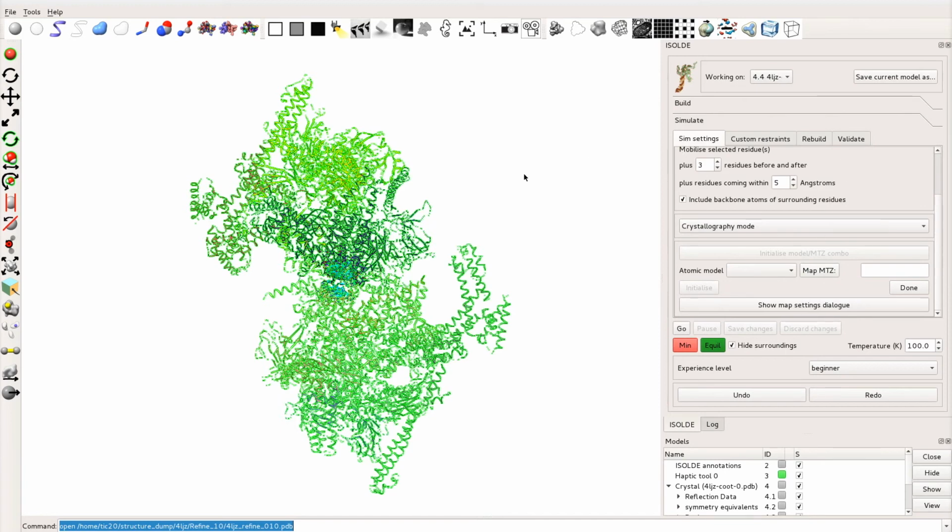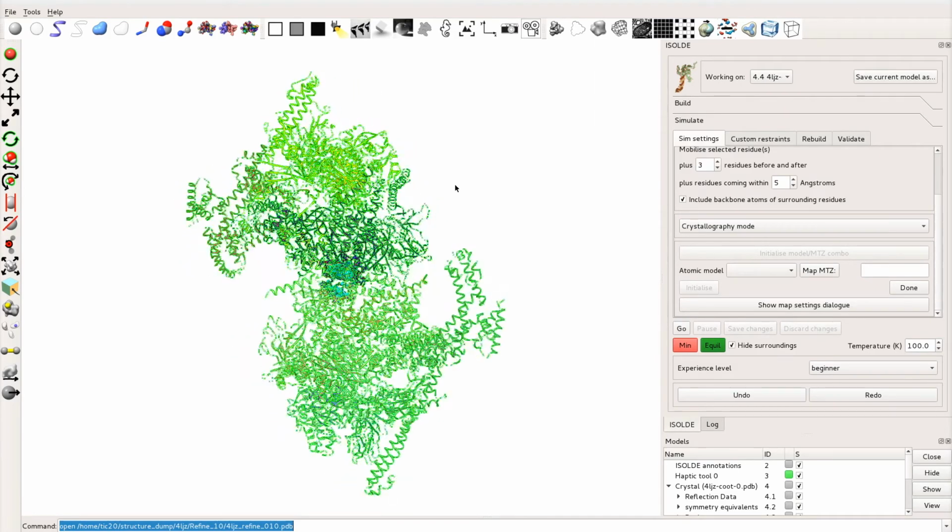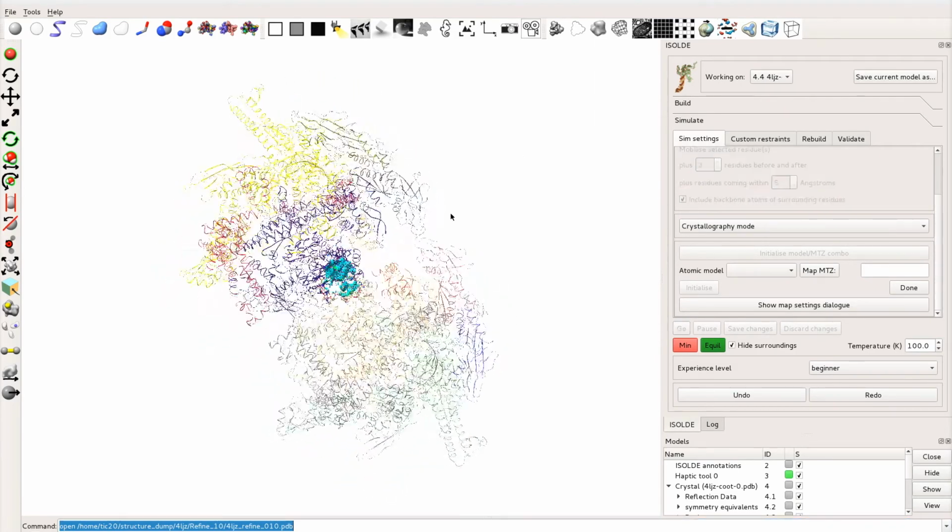One big caveat here. Due to the aggressive way in which the Isolde simulations sample the maps, it is very important to ensure that they are generated with the free reflections excluded. This is not the default behavior of Phenix.maps, so you will need to set it manually via the Phenix GUI or in the Phenix.maps configuration file.